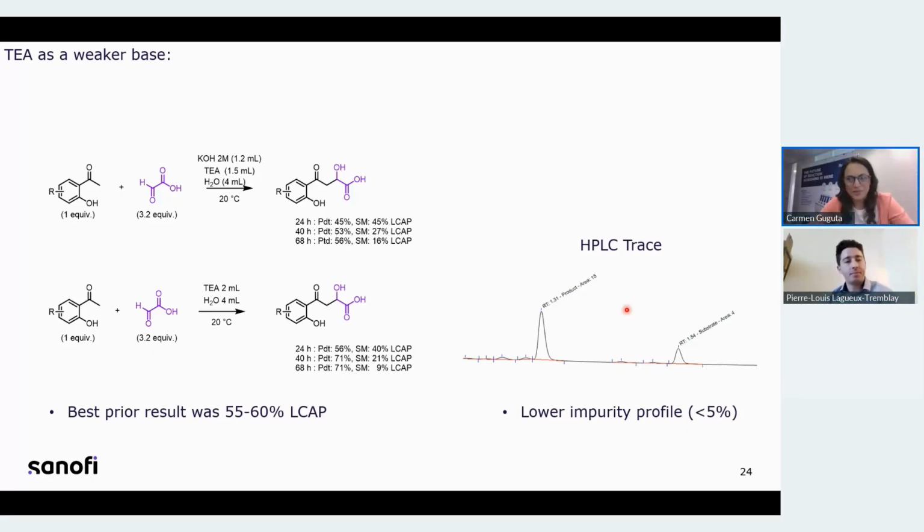Indeed, the sampling takes place through the tubing to a shaft that is exactly in the middle of the smart cap in your reactor. I do not have a picture with me now, but around this shaft that is in your reactor, in contact with your reaction, you also have your stirrer, so it's mixing. When you take a sample, by making use of nitrogen and changing pressure, the sample is, as Pascal was saying, sucked into a pocket in the smart cap.